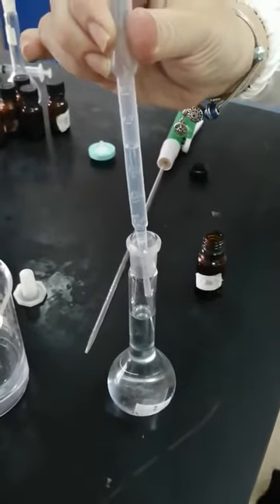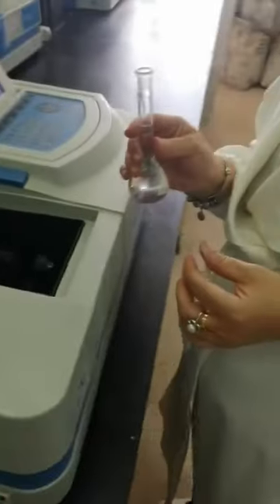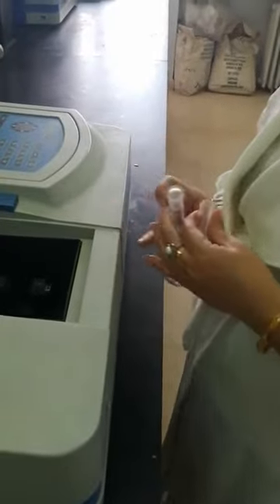I have to see the meniscus, then close it and invert it. This is my diluted sample. Last step is to measure the absorbance using UV at lambda max 243 nanometer. This is my cell.